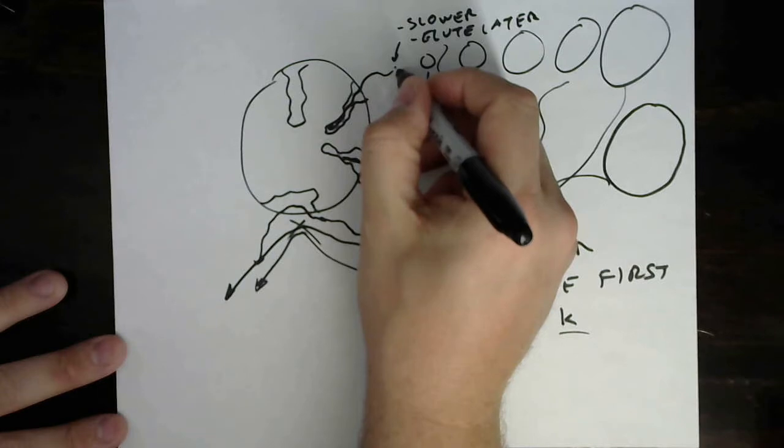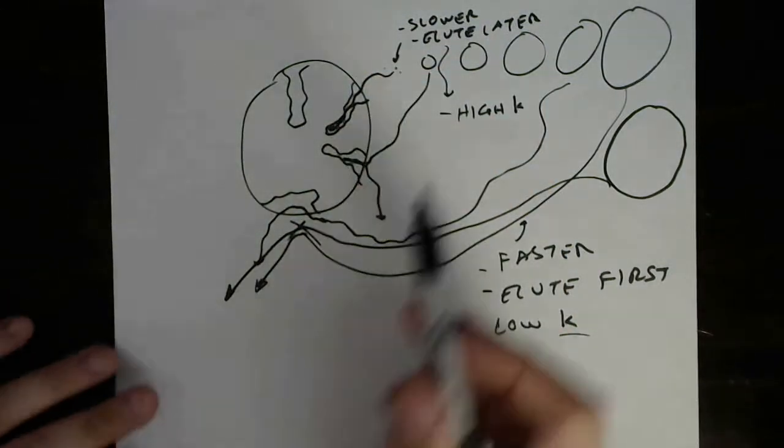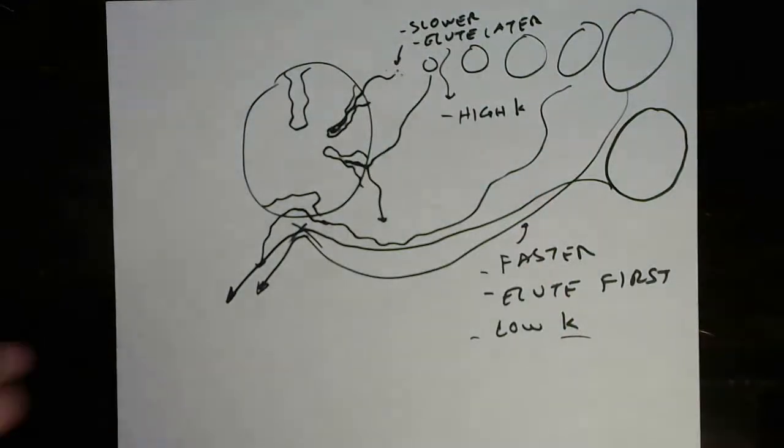And we can imagine even smaller particles here that also have full access to every depth of every pore. And so there will be no resolution here either. They will have the same K values and they will end up in the total inclusion peak.